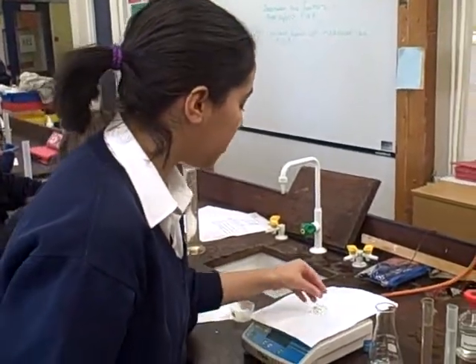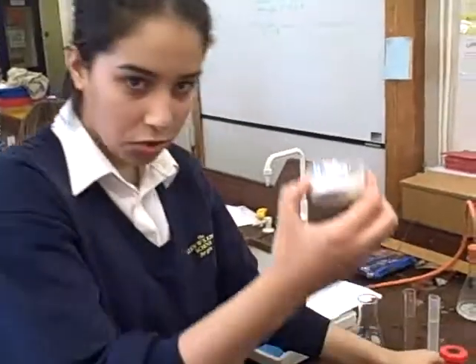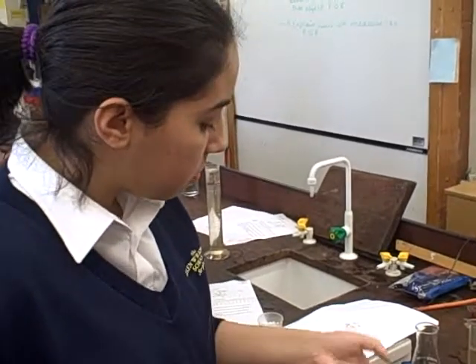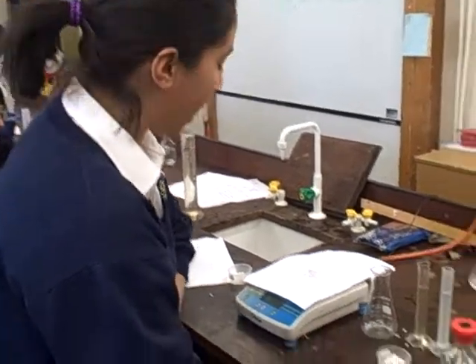We're doing a reaction where we're trying to study rate of reaction, and what we're going to be using is hydrochloric acid, some marble chips, our conical flask, and our quarter base. Now the first thing we're going to do, as we've been told on the sheet, is use three marble chips — but since we're weighing, we're going to use ten grams.